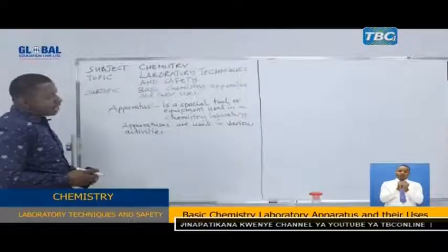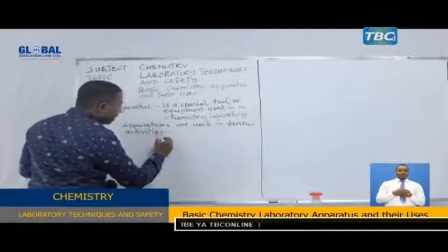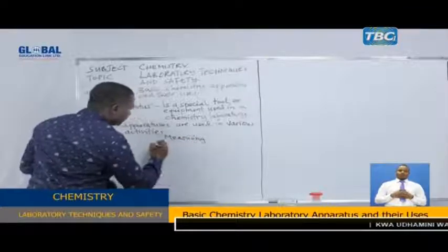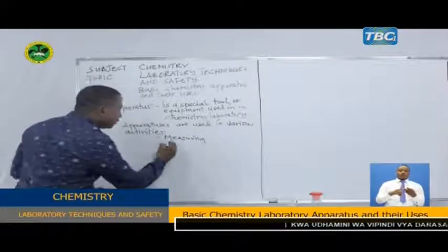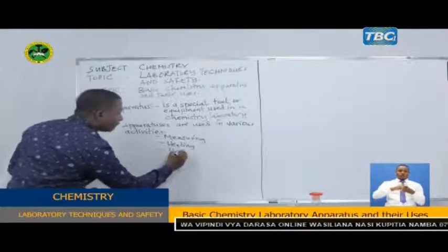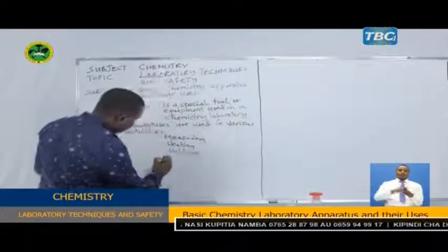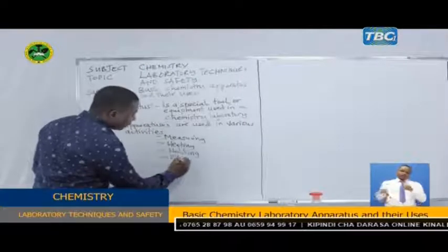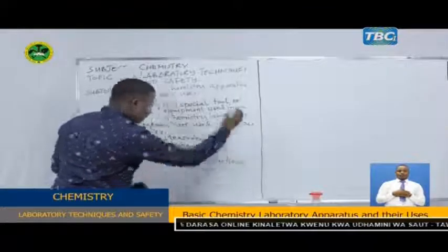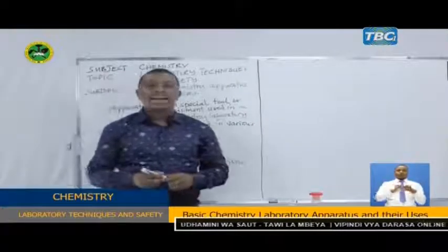Apparatuses in the laboratory are used in various activities, such as measuring, heating, holding, and chemical reactions. So those are the various uses of apparatuses in the laboratory.